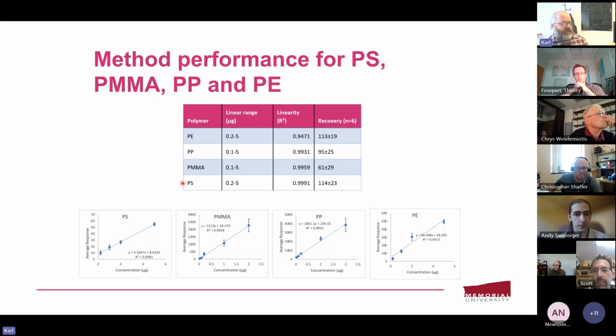But I've also seen, from work that's been communicated to me by others, and I don't want to say who or what, that depending on the polystyrene source of the standard you use, the response factors can be quite different. I'm looking to the polymer community to maybe comment on that, because I think that could be a significant problem if we're trying to do this. Now, as a first shot at it, are we happy with an order of magnitude estimate?